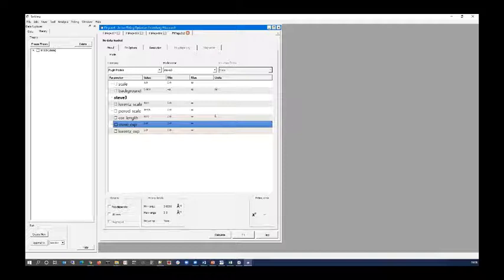In a small angle scattering experiment, the scattering we observe reflects the arrangement of regions of similar scattering length density, or by inference, similar bulk density, since the two are related. So we're effectively measuring a density correlation function, and we can extract that from the scattering data by inverting the Q space data into real space, and that's what correlation function analysis will do.